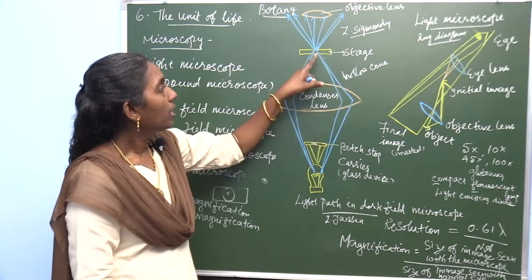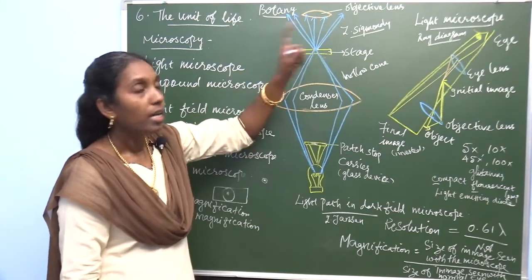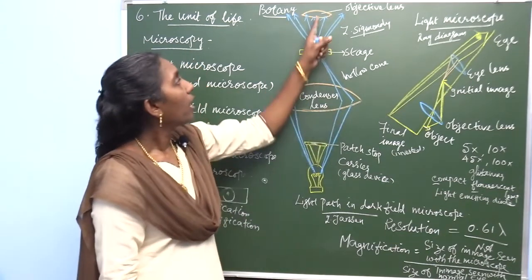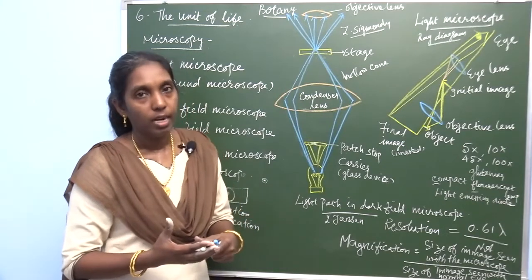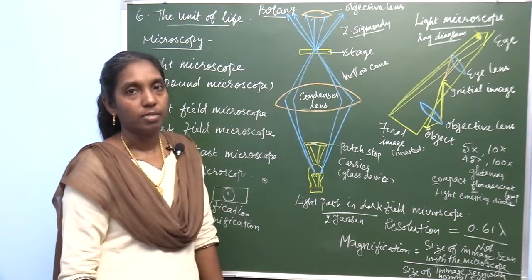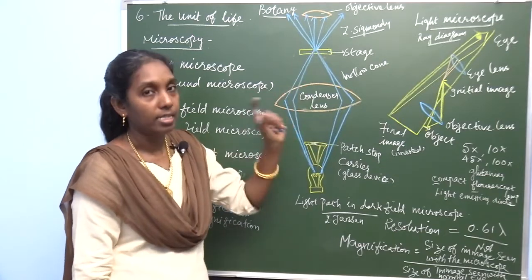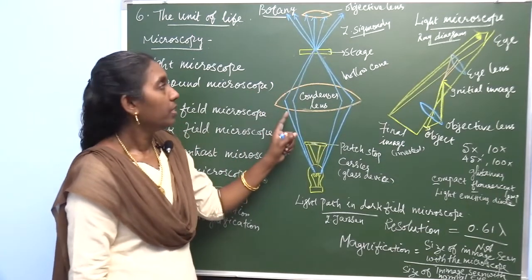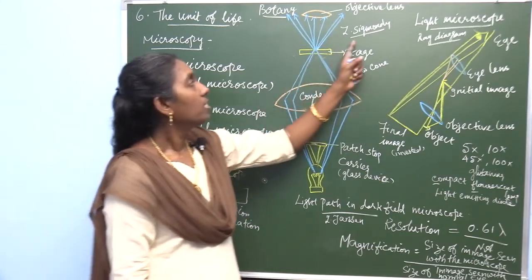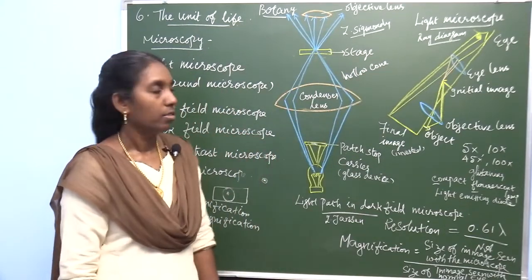When the light reflects from the object, it again focuses to the objective lens. At first there is a condenser lens and here there is an objective lens. So it focuses the image in the objective lens. Through this dark field, the object is glistening now. This simple method of the dark field microscope was explained by Zsigmondy.